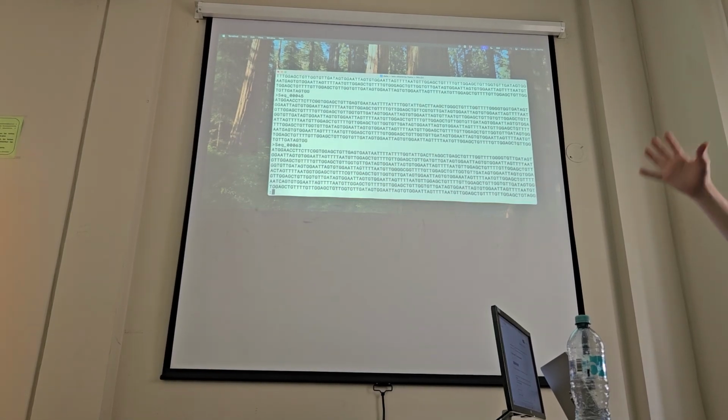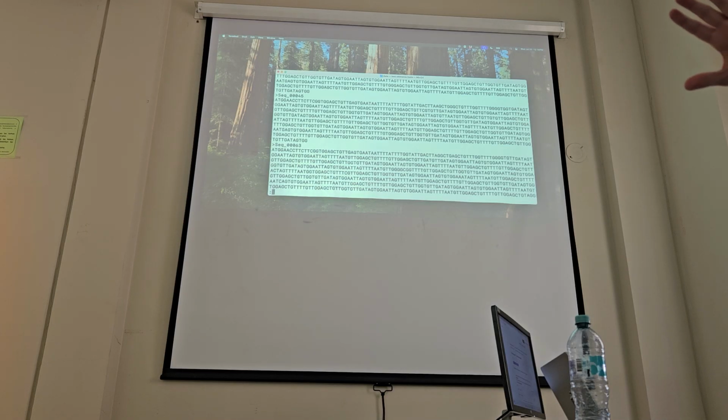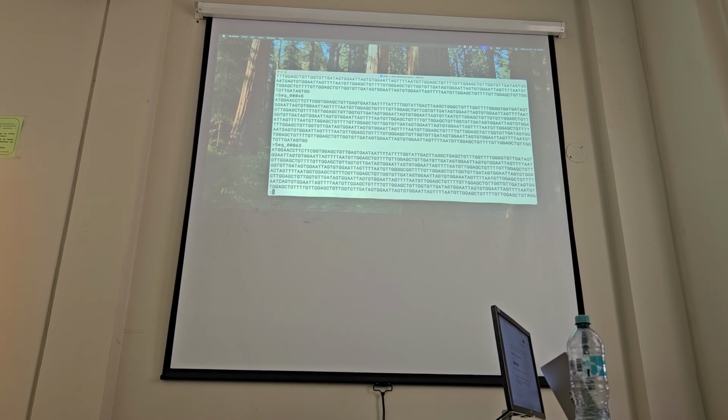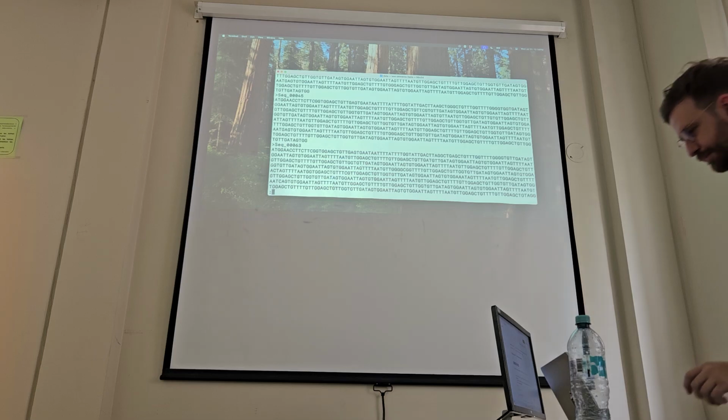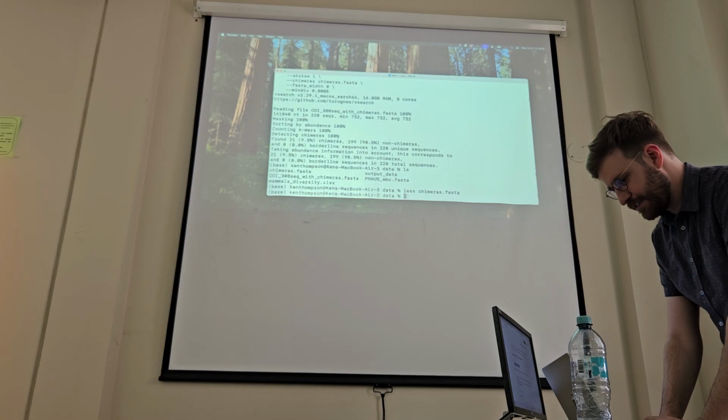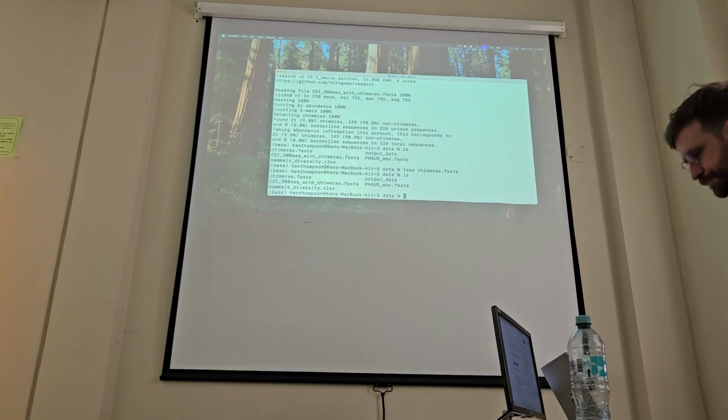Then you stitch these together as parts of different pipelines. I'm going to see if I can get some things working on these computers so that you can do these exercises yourself. But it's really challenging on Windows. You get to use some modifications. So, yeah. Sorry that you can't do it yourself, but that is how it goes.